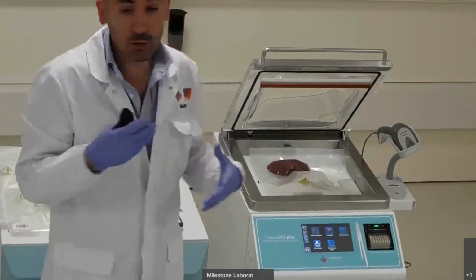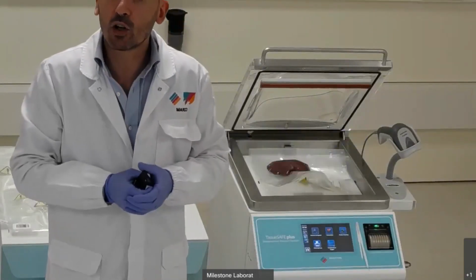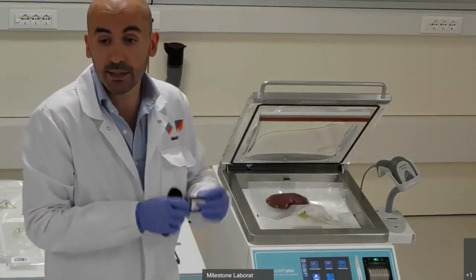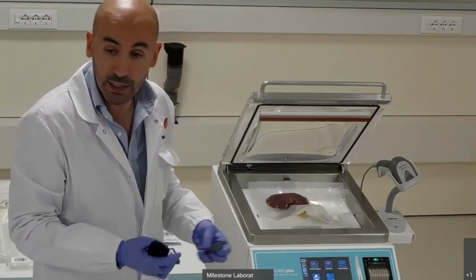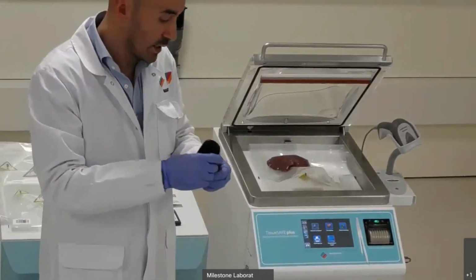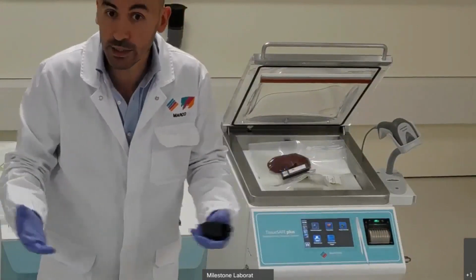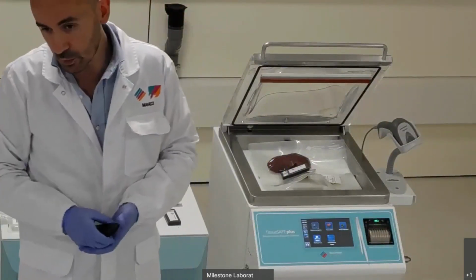But before that, I want to recall the fact that Mark mentioned in this presentation, that in cold condition, this specimen can maintain optimal morphology up to 72 hours. That's why Milestone has developed the temperature data logger that can be loaded here on the side of the instrument at the end of the procedure, and then coupled together with the specimen. From the moment of the activation, the temperature of transportation up to the reaching point, which might be, for example, the grossing table, can be monitored. And so we have the complete traceability also of the transportation.